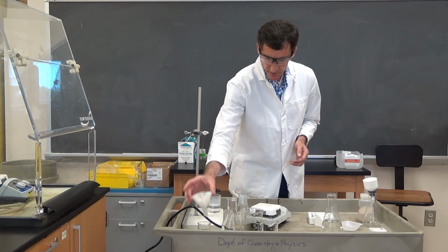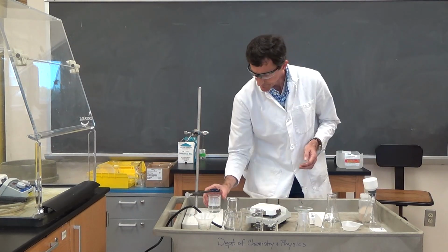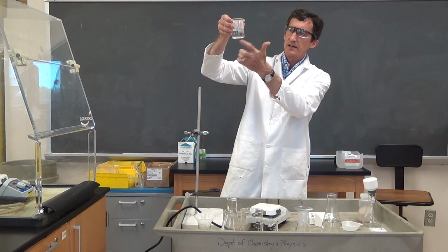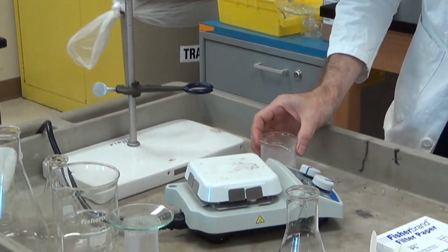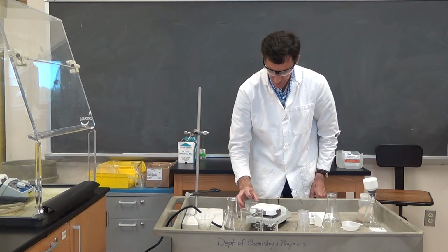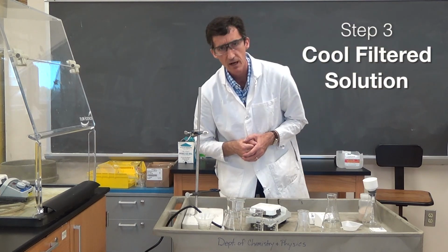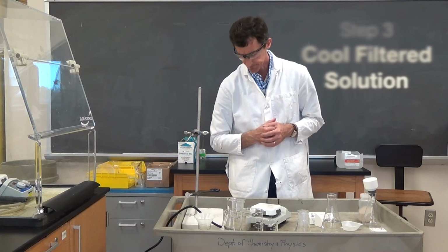So now I can set this aside. That's been rinsed out. Now we have this here. It's actually already starting to crystallize. There's certainly no sand here. It's still a little warm. I'm going to also cover this with a watch glass to cut down on evaporation. And the idea now is to let this cool and hopefully deposit crystals or repurified solid.